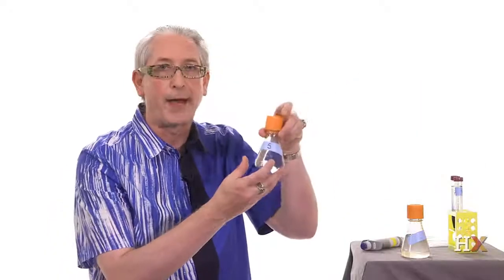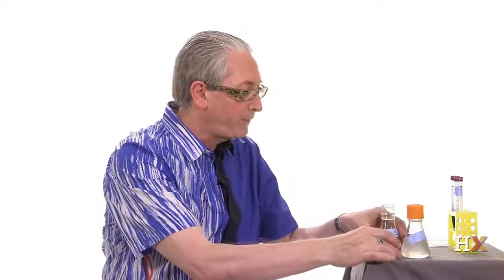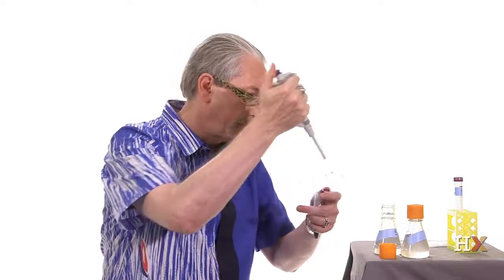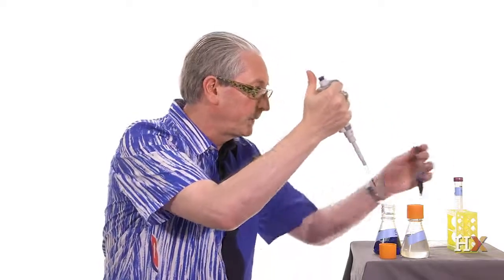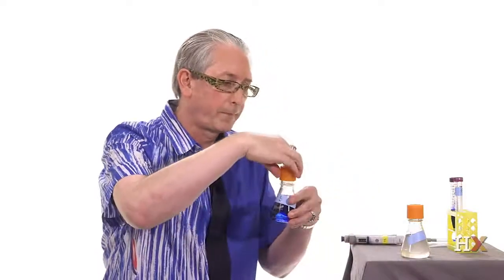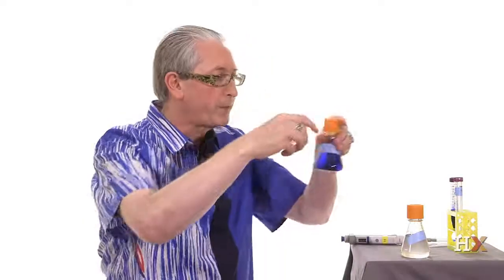So here I take this flask, which is labeled S, and I happen to have methylene blue. How surprising. We'll just add, here we go, my methylene blue. I will close the flask and shake it. Okay, so it turns blue. Okay, so we let the solution rest for a few minutes.